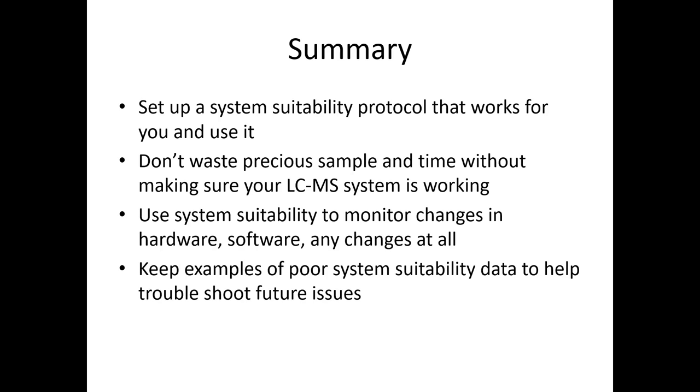All right, so in summary, set up a system suitability protocol that works for you and use it. It doesn't have to be complicated. I am of the mindset that you should do whatever is the simplest thing for you to do and start there. And if it needs to become more complicated, then you can add in those levels of complexity.